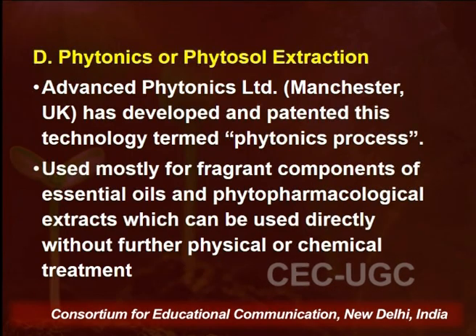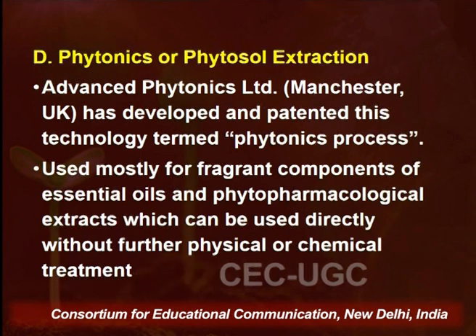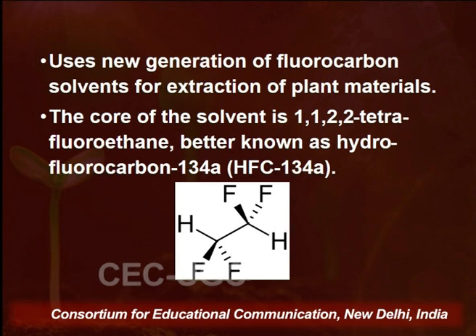Another modern technique is phytosol extraction, which was developed by Phytonics Limited in Manchester, United Kingdom. This technique was used mostly for the fragrant components of the essential oils and to prepare phytopharmacological extracts, which can easily undergo thermal degradation. Now this process involves the utilization of fluorocarbon solvents.